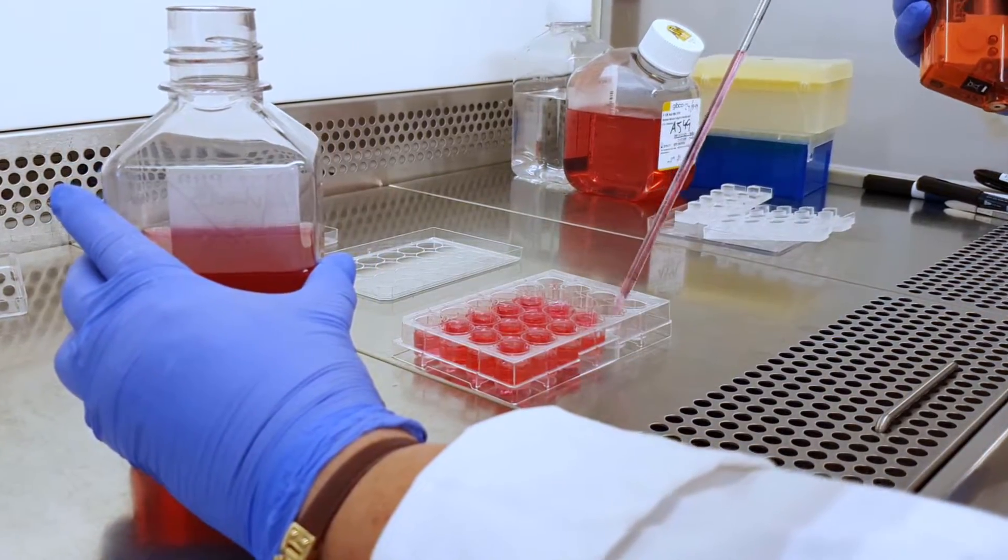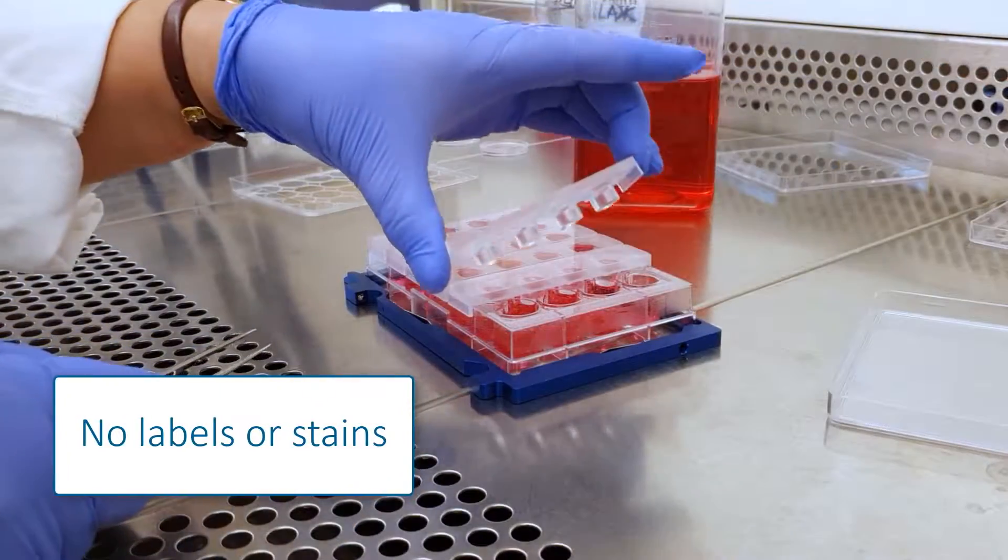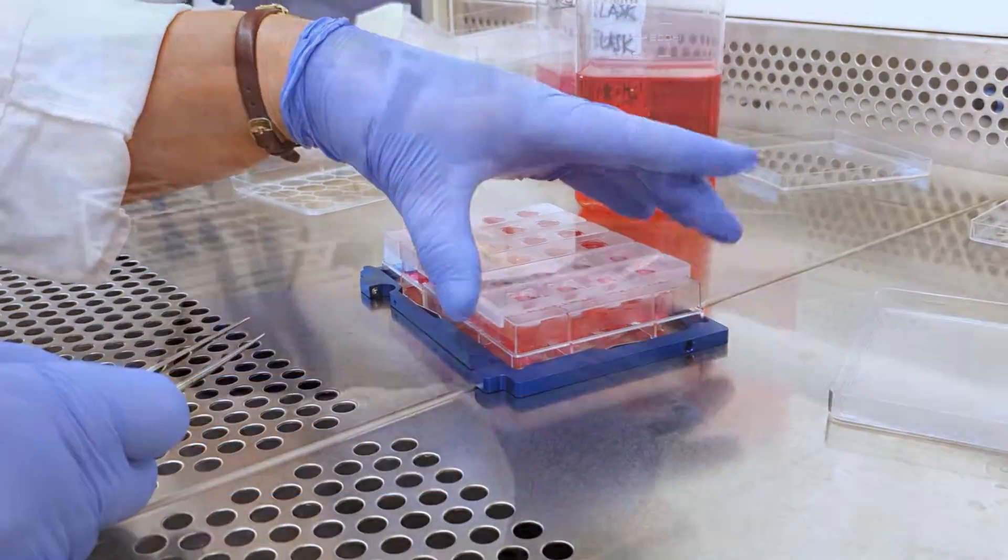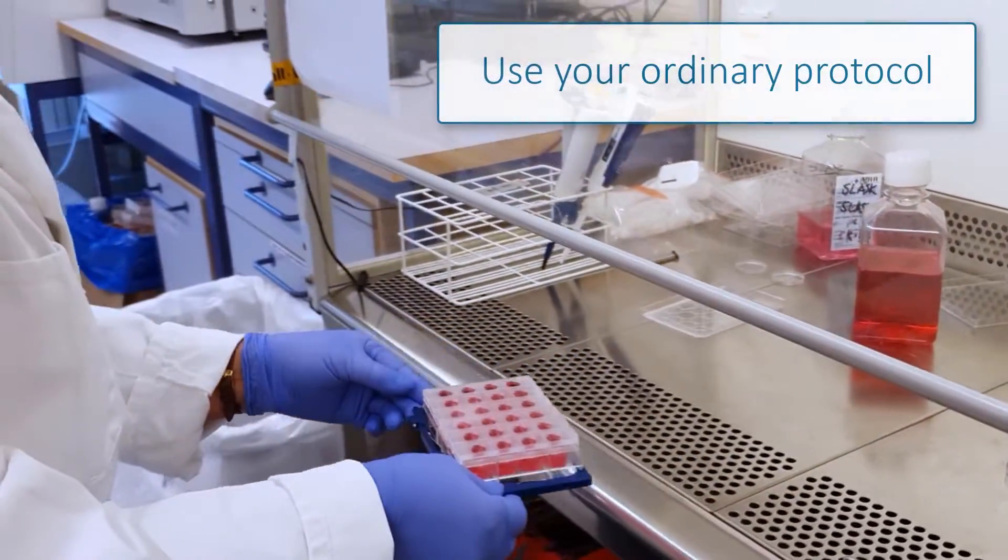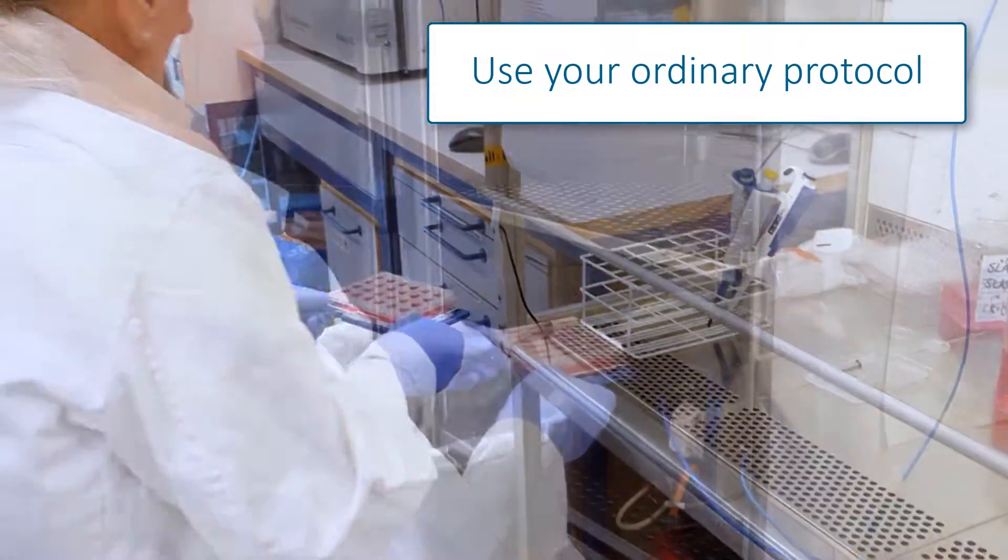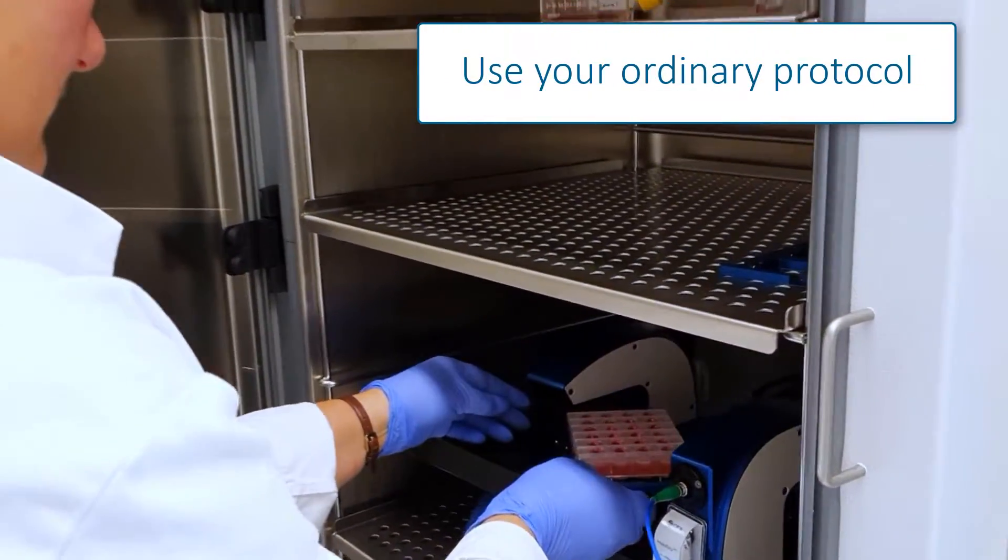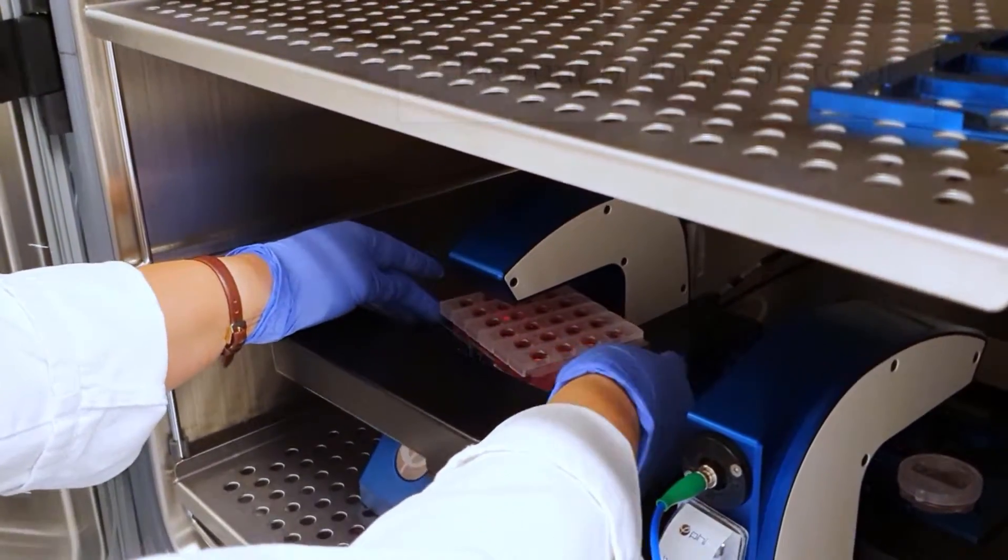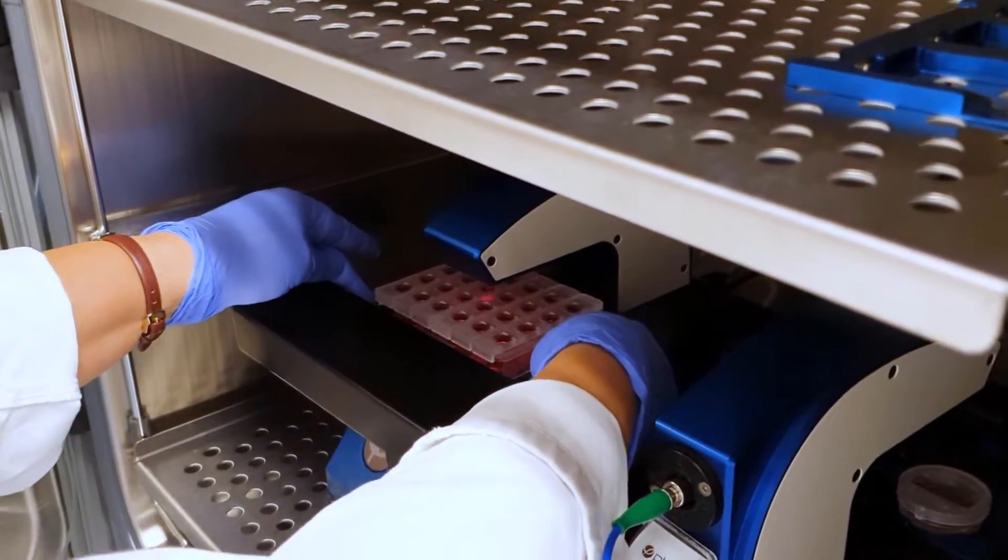Holomonitor makes your cells visible without any labels or stains. Just prepare the cells according to your normal protocol and put them under the microscope placed in the incubator.